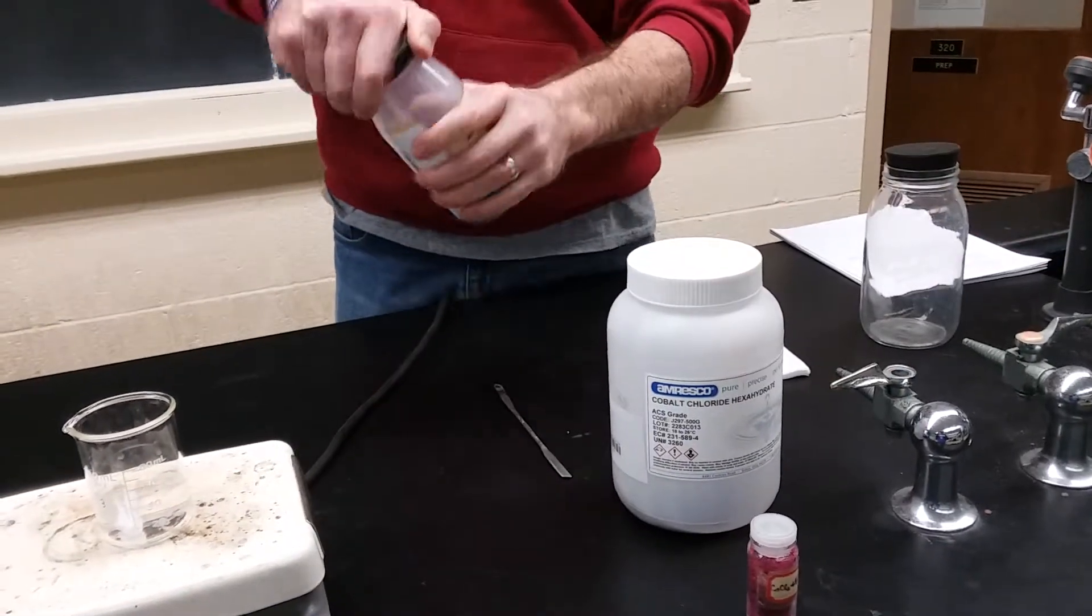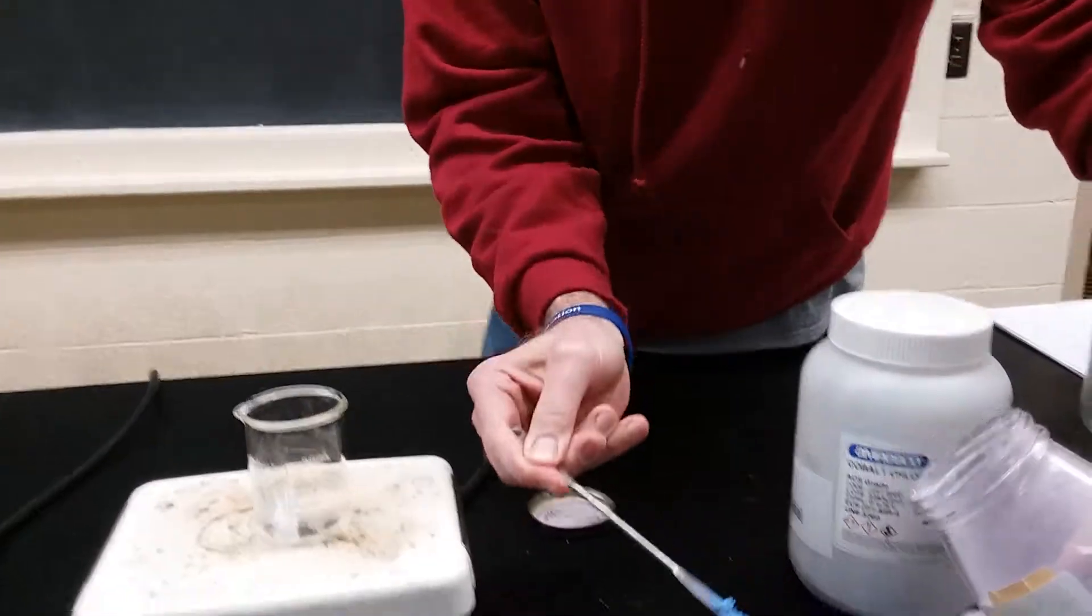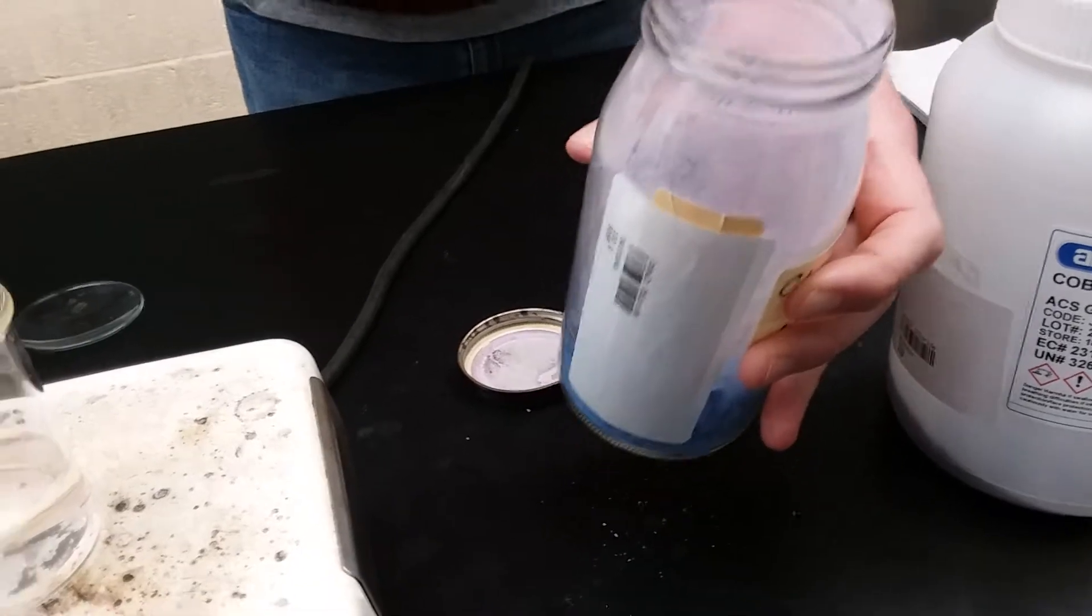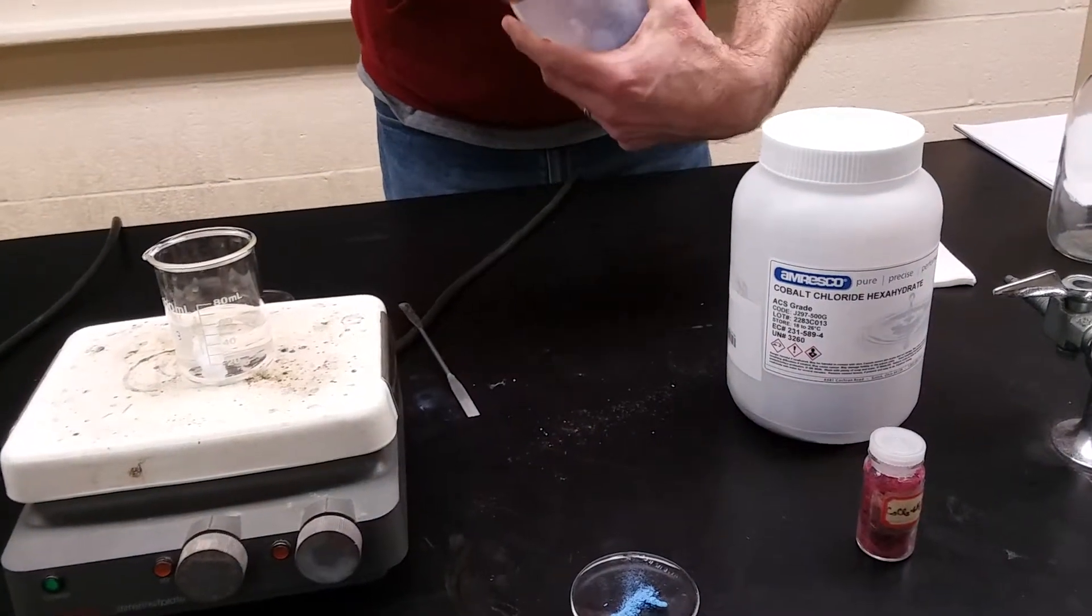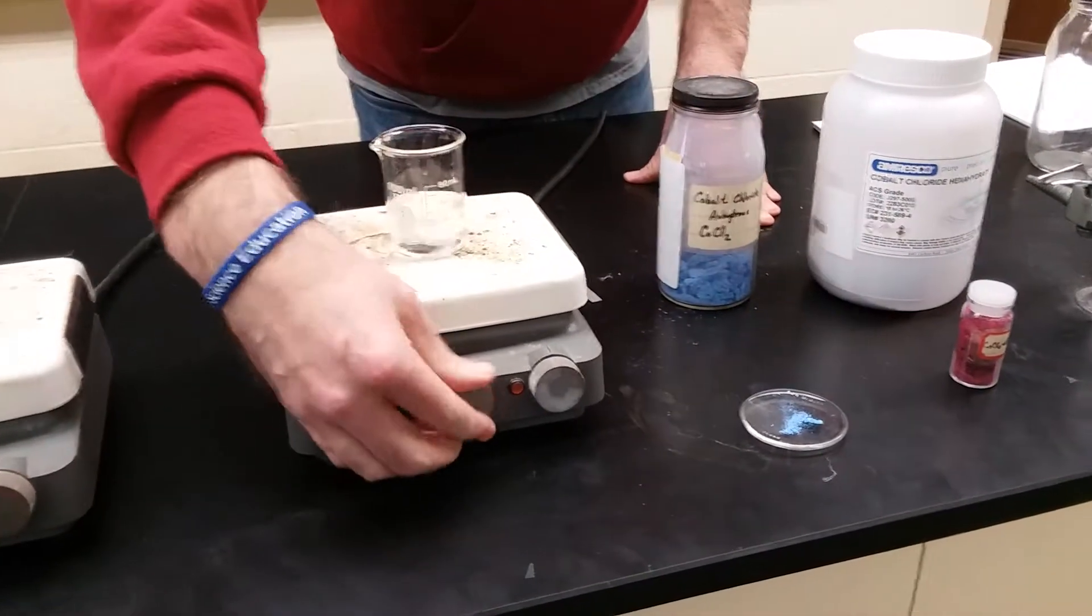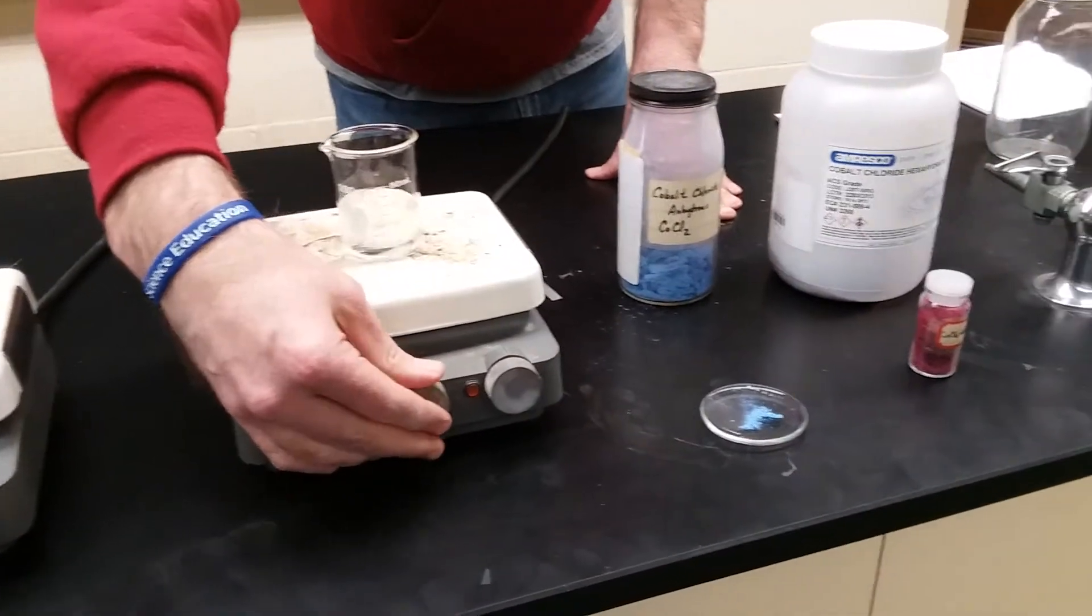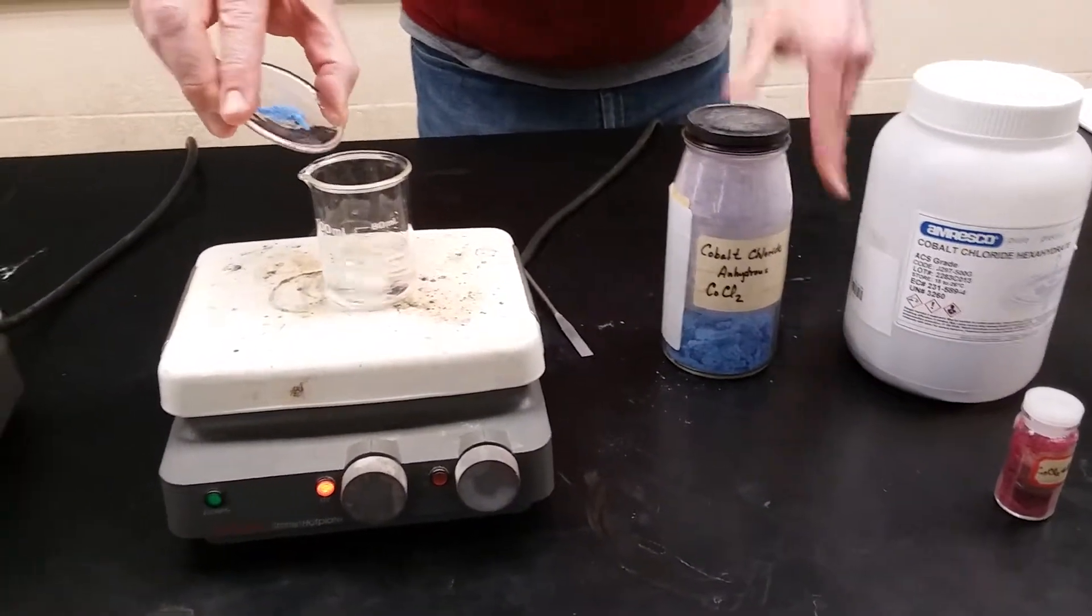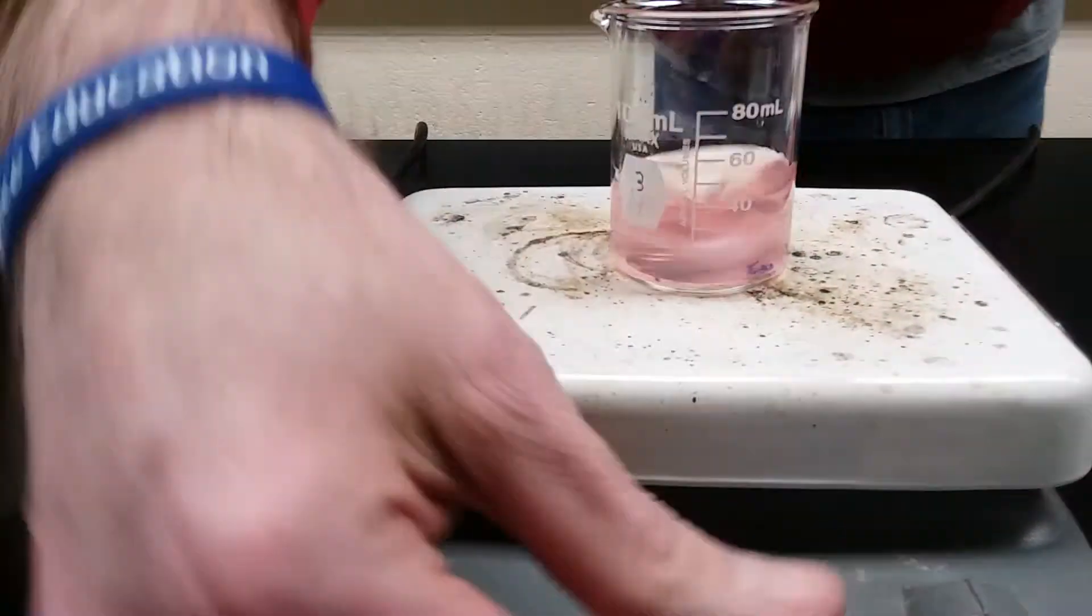So what we should see is I'm going to take some of this out and put it on a watch glass so you can kind of see it. If you look at the jar carefully, there actually is some purple-reddish around because it's absorbing water from the air. So I have to keep this thing capped as best I can. And I'm going to do the same thing here now. So when the water is gone, it's blue. When I put the water back in the form of just a beaker of deionized water, what do you think is going to happen? I put blue powder into water. Well, it turns red.